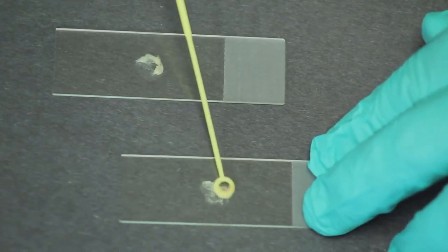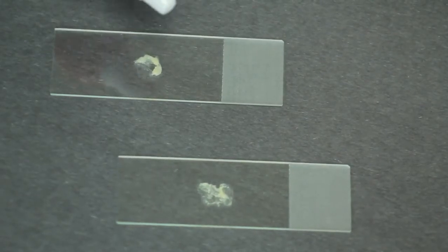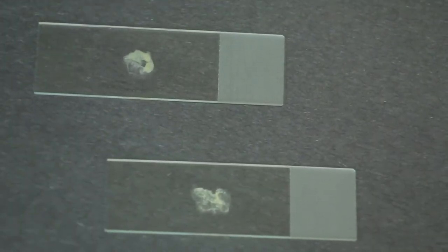Place it in the center of a blank, clean glass slide and simply add a few drops of hydrogen peroxide to each one. Notice this test does absolutely nothing in the presence of hydrogen peroxide.